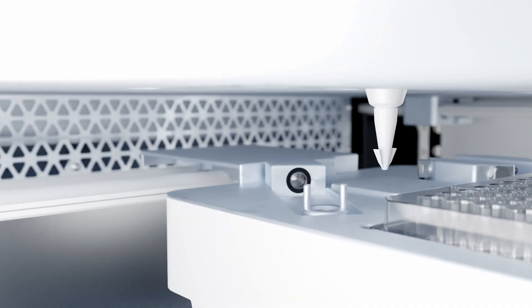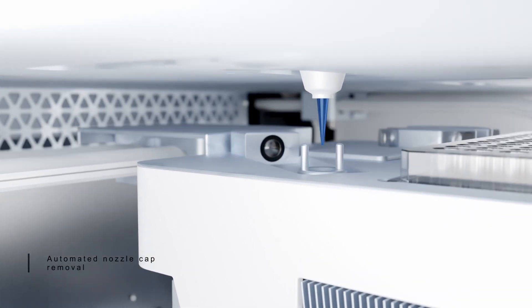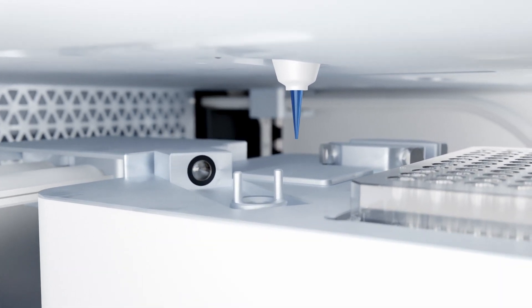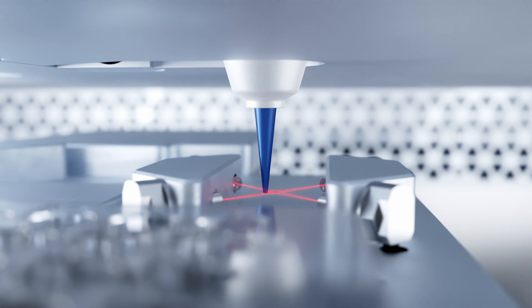Complemented with a lid gripper to remove well plate covers, a nozzle cap removal system, and auto calibration, the BioCellX ensures a totally hands-free experience that fits in with conventional assays.